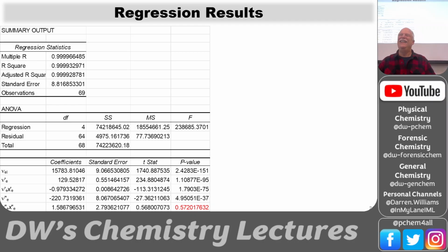Cut to the end, right? Cheat code. No, don't do that. We'll look and see if your data matches. But anyway, how did we do? Okay, we did pretty well. So 4 9s in the regression analysis.